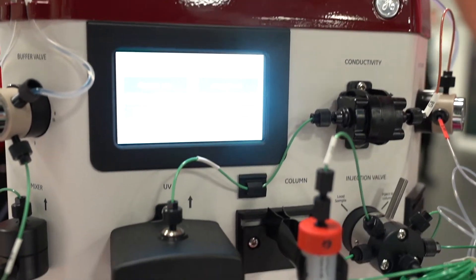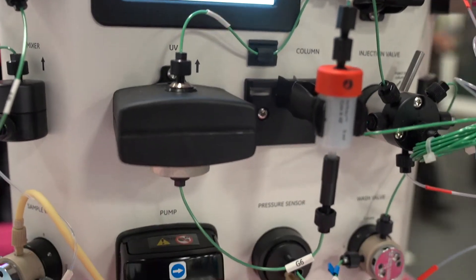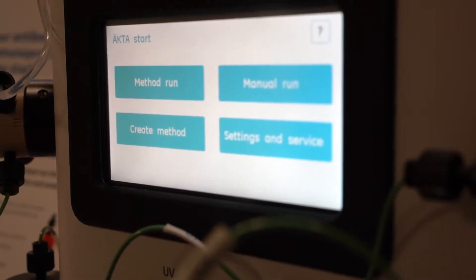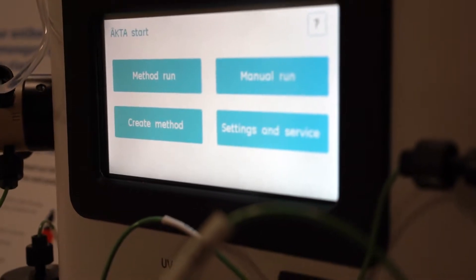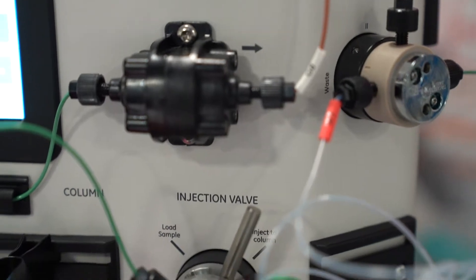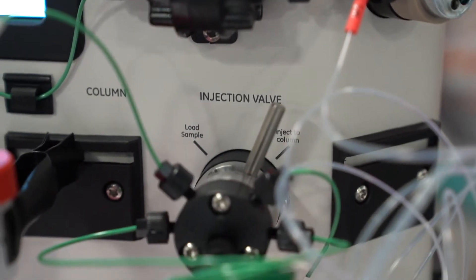It has a really small footprint and it's ideal to be put into your cold cabinet. The system comes with a built-in method template, which can be seen on this display here, making this equipment a very simple plug-and-play system.